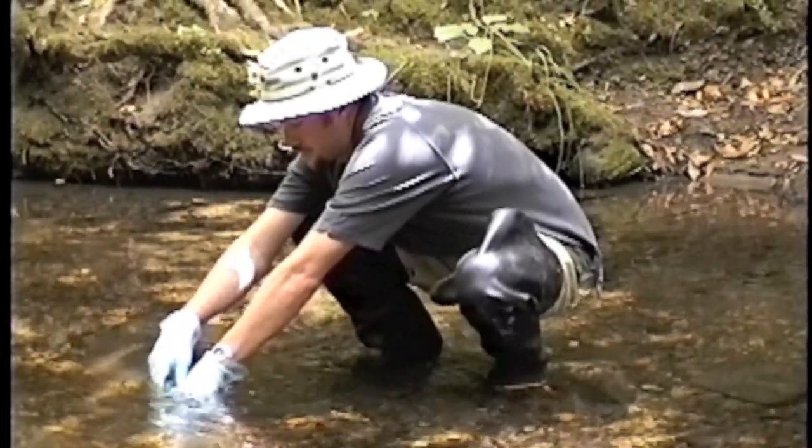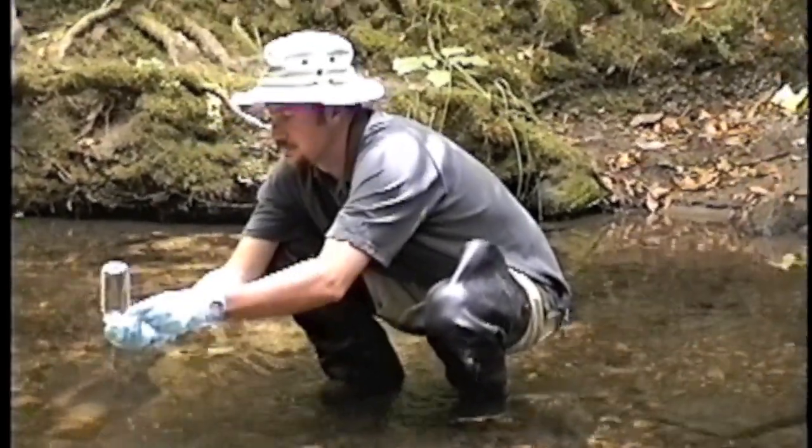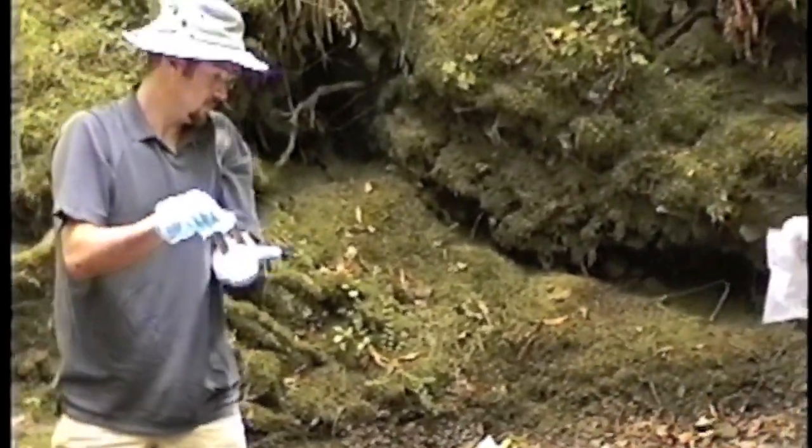He fills until the bubbles stop coming out. And when that happens, he is going to tap it under water and check if there is a bubble. This is a very nice sample.